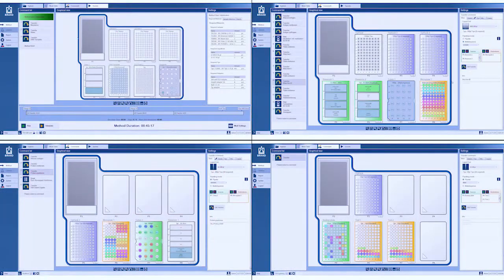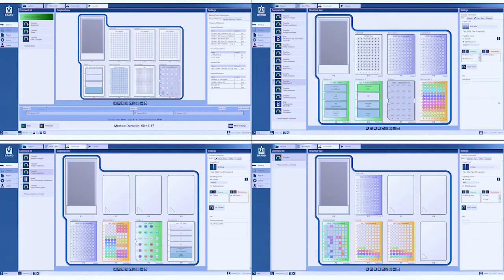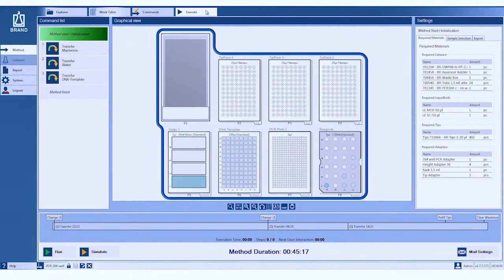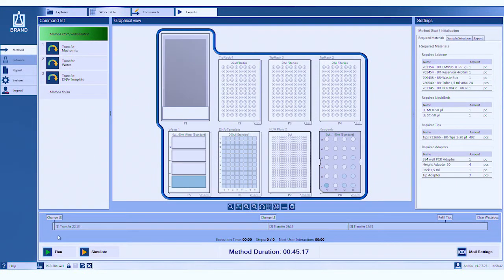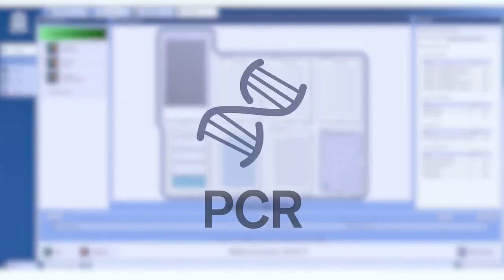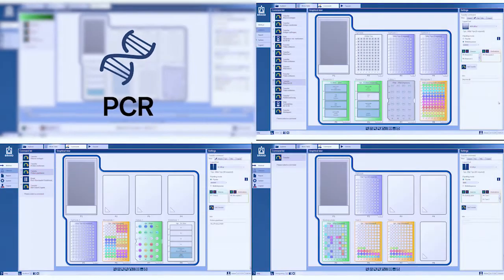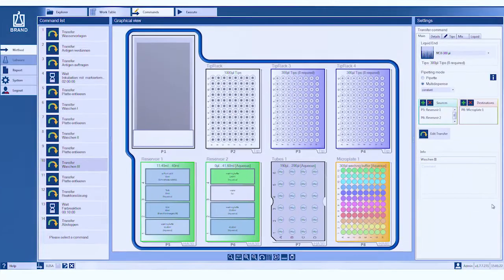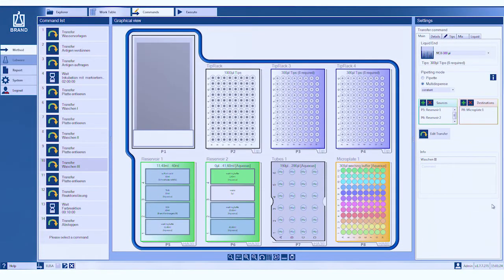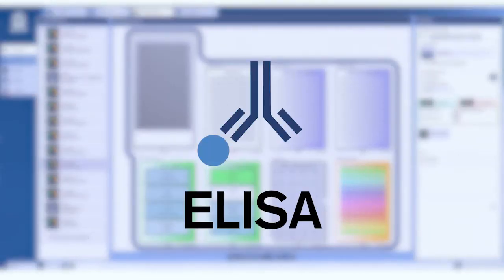The liquid handling station saves time for most pipetting tasks in the lab. For example, PCR and qPCR, precise pipetting of small volumes. ELISA, no more tiring serial dilutions.